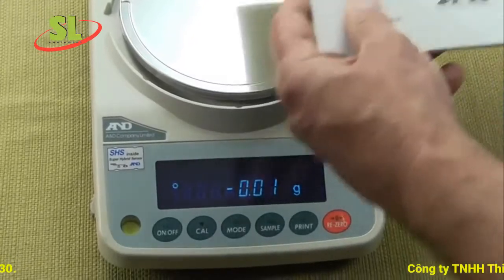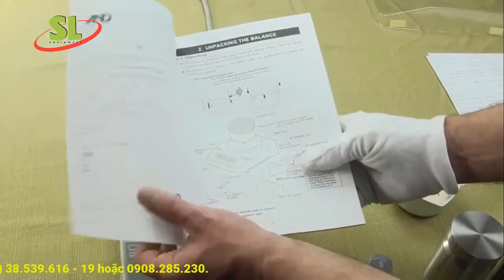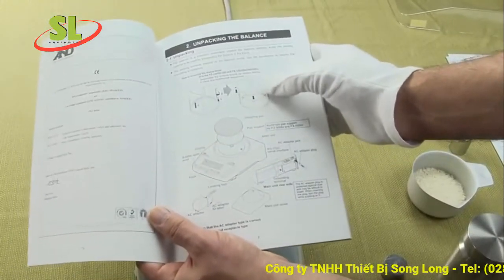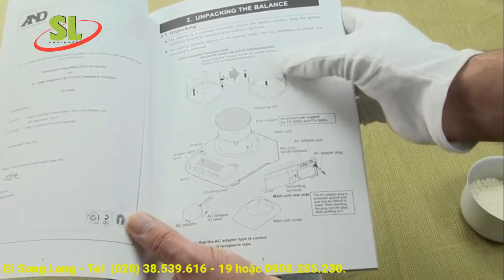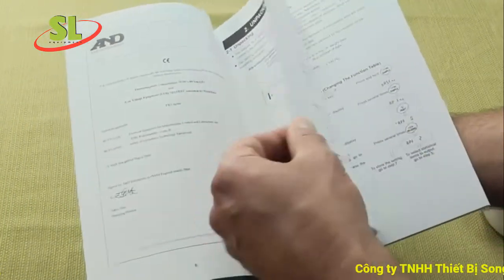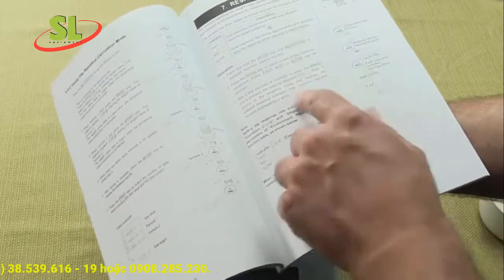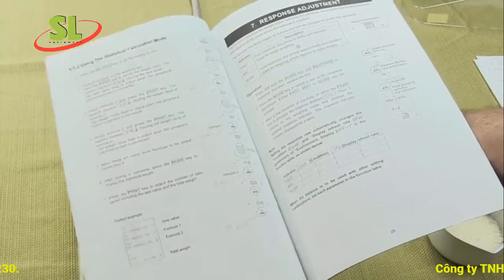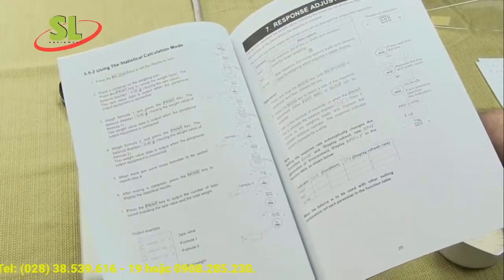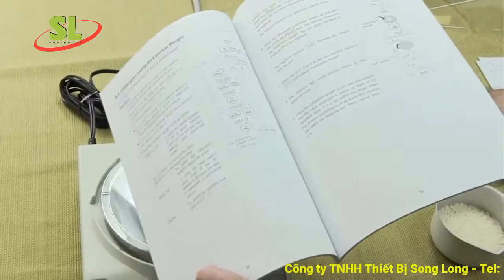A&D has one of the best user manuals in the industry. Competitors have very complicated and hard-to-understand manuals — their goal is really to prompt a service call so they can get you on a service contract. A&D gives you step-by-step procedures on setup, response time, and configuration, all extremely simple. All the information is right here in the manual.